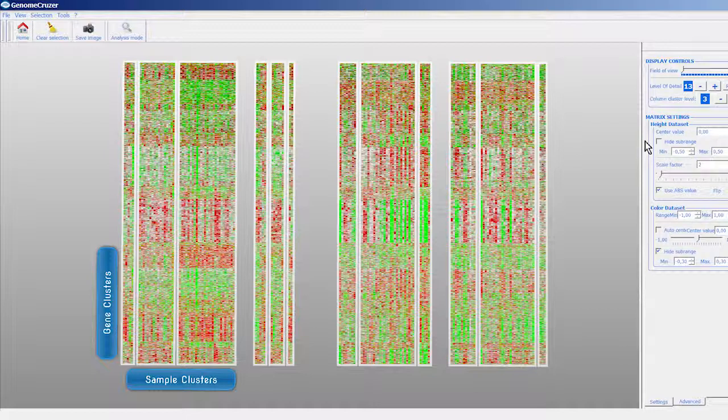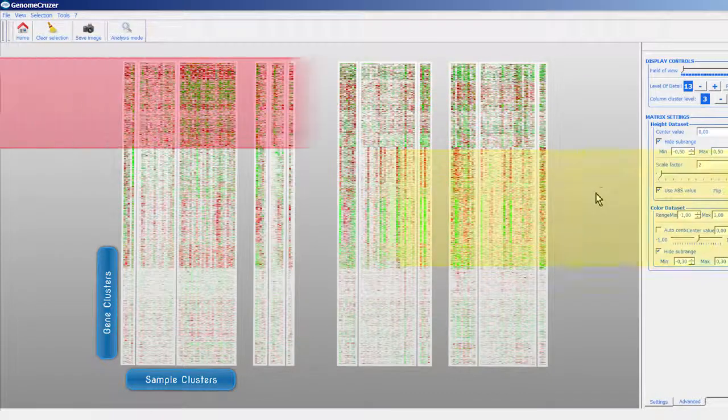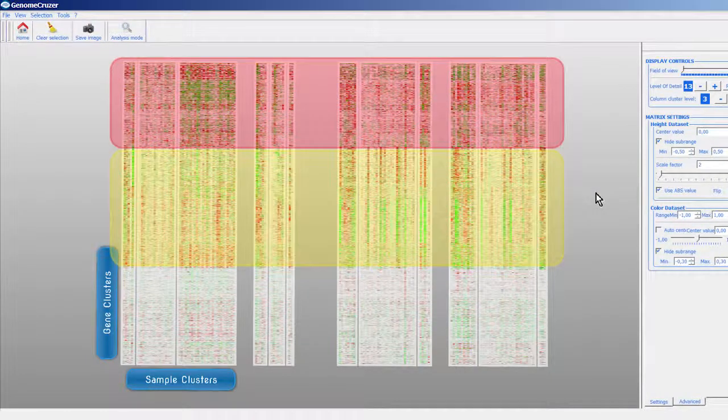So we can again exclude and keep only genes that are highly hyper or hypomethylated by hiding objects that have intermediate methylation values. And now it's much more clear the rationale for classifying the genes in the 3 classes that we described before. So class A genes here, class B genes here, and class C genes here.